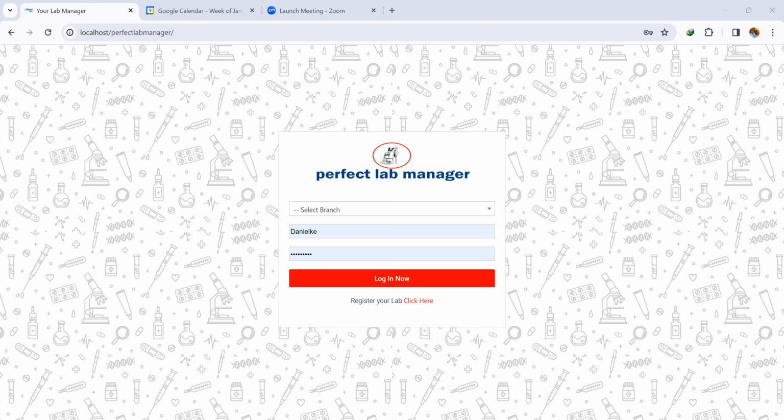Perfect Lab Manager is a comprehensive lab management software that is designed to help with the day-to-day operations and management of a medical laboratory facility. We understand the growing demand of medical laboratory and diagnostic facilities, and the complexity and diversity of such businesses.